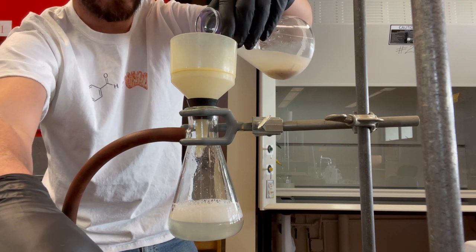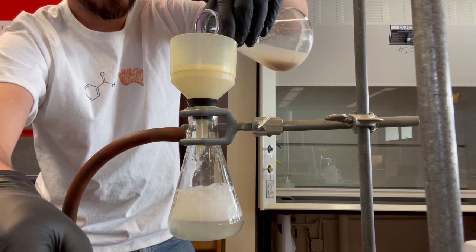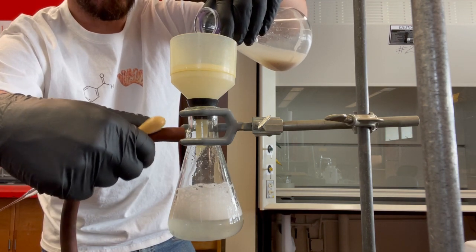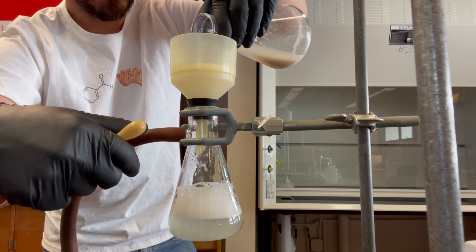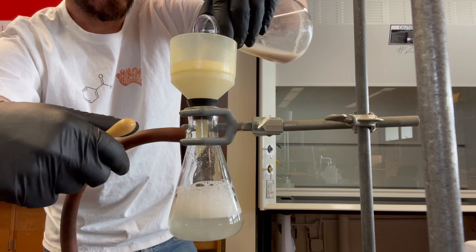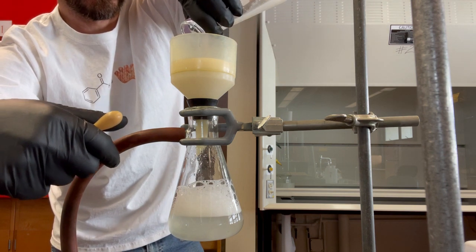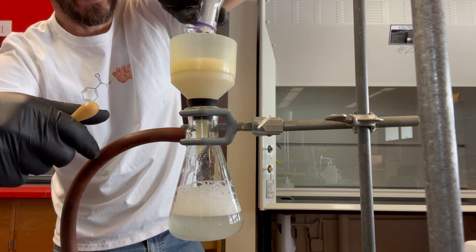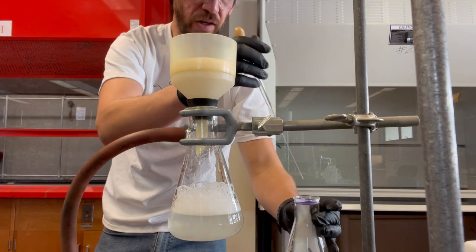I just turned the vacuum off so that I wouldn't ruin this process and have all those bubbles get inside of the vacuum line, because that's never good. So check this out. We are almost done. So the idea would be to slowly pour it for a couple reasons.